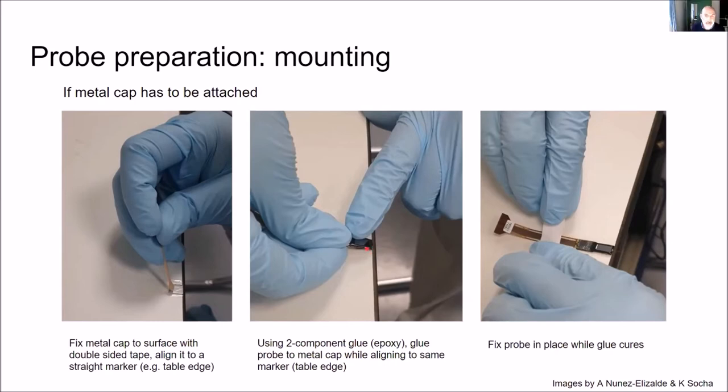Otherwise your shank will cut through the brain instead of going in smoothly along one dimension. One idea is that you fix the metal cap on the surface like this table and align it to a straight marker like this edge of the table. Then you can apply some glue on top of the metal cap, for example two-component glue like epoxy, and then you place your probe. The audio went funny. Can you do the second step again? After you have applied the epoxy, you just put on the probe and align it carefully to the same straight marker, for example this edge of the table.